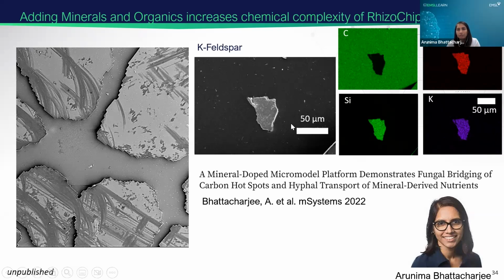Thank you, Jade, for the nice introduction to the first two platforms. So next, I'm going to describe to you two other platforms. One of them is the pore-scale micromodel, and the other one is the SubTap platform, which are compatible with both plants and microbial culturing.